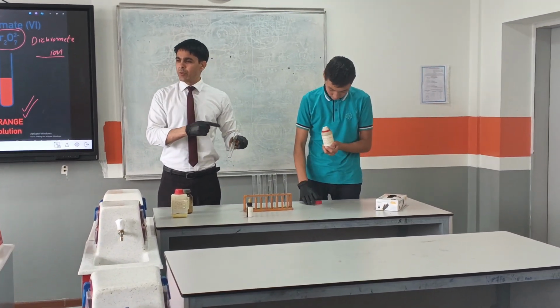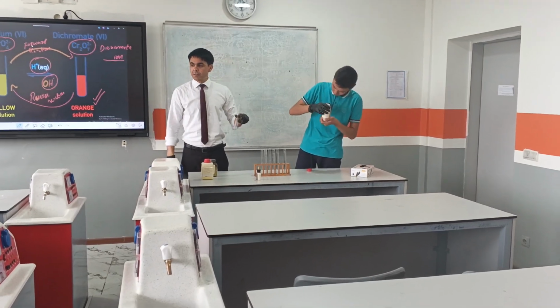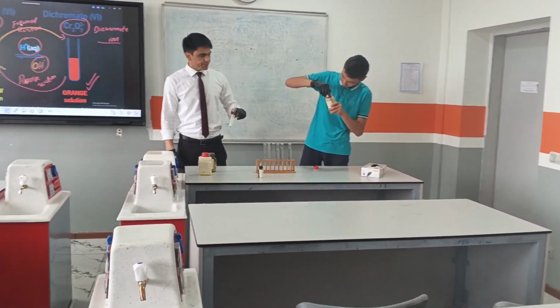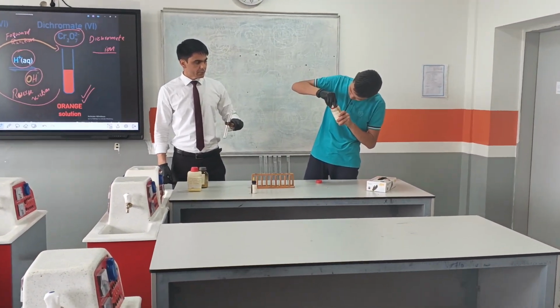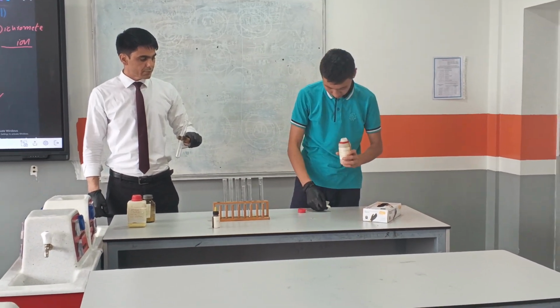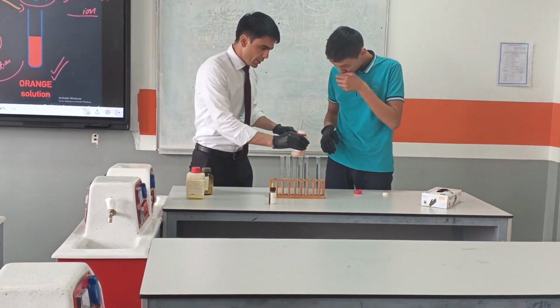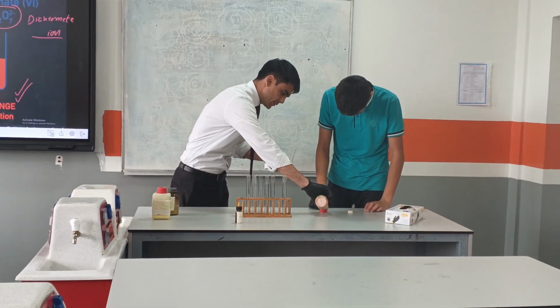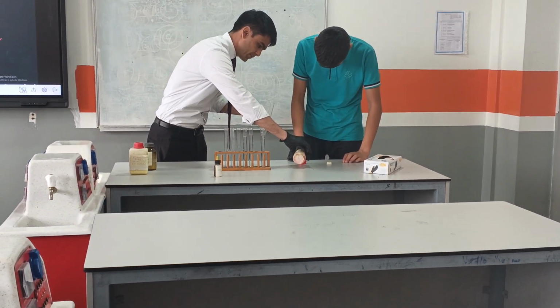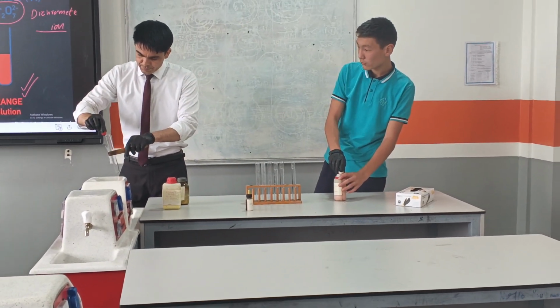First, which solution are we going to prepare? Dichromate. Just a little amount.